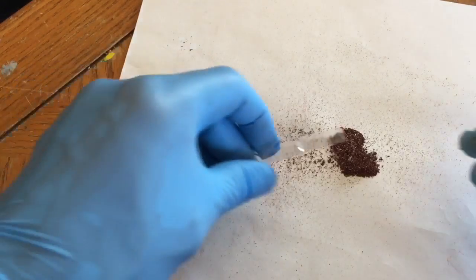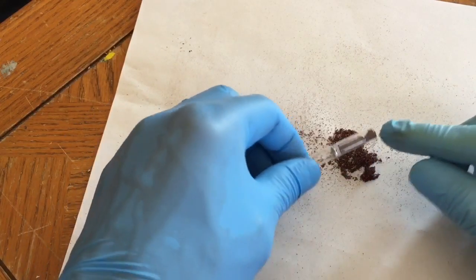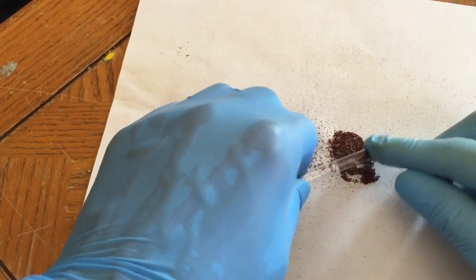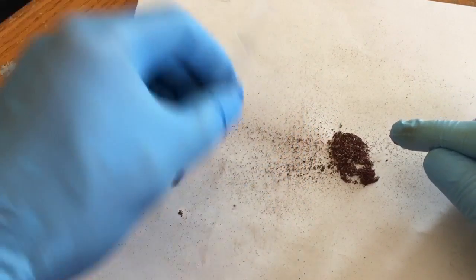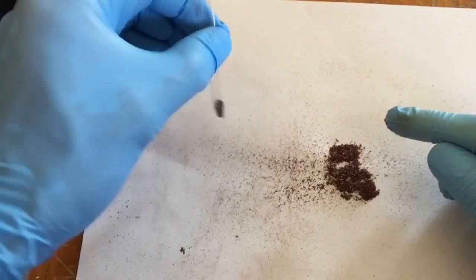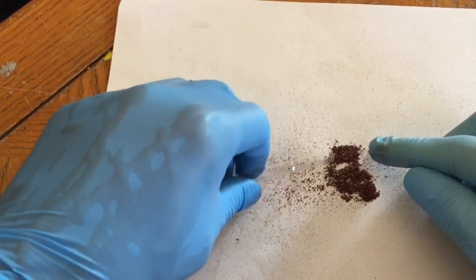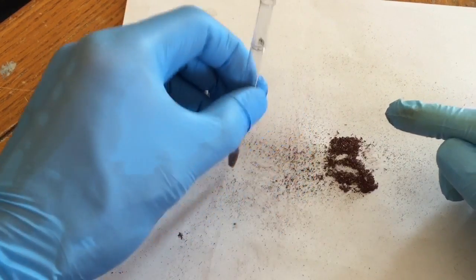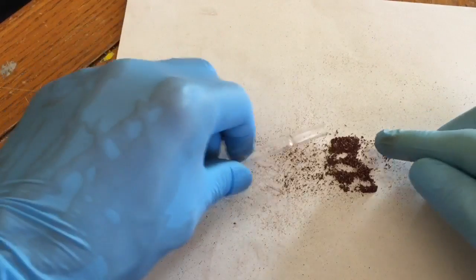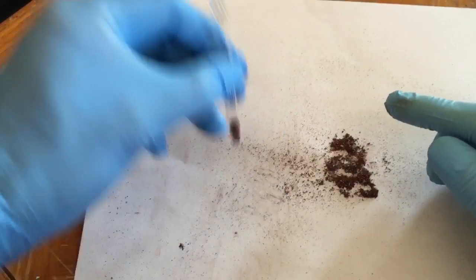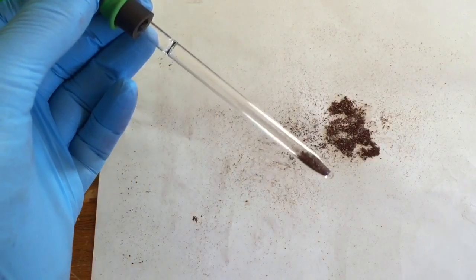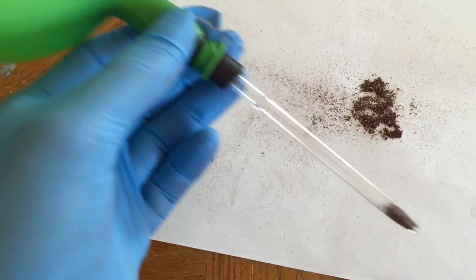Now we're going to put a small amount of this red phosphorus, this amorphous phosphorus, in this tube. Fill it up maybe about just fills the bottom like that. Here we go, that's a good amount.